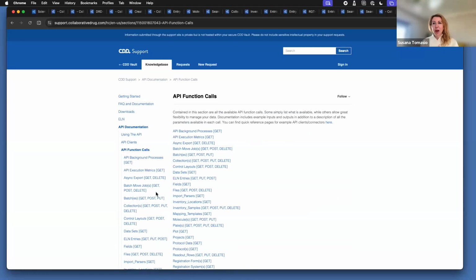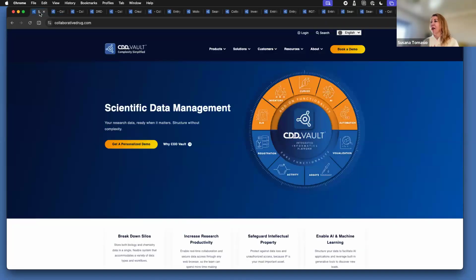Okay, so I think that's kind of what I had in mind to show you as an overview of the system. Now we have some time for questions. Yes, happy to answer questions, and thank you for your attention so far.